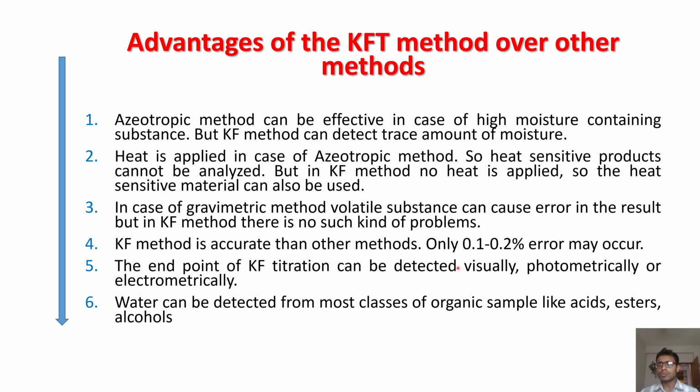Only 0.1 to 0.2% error may occur. The endpoint of KFT can be detected visually, photometrically, or electrometrically. Water can be detected in most classes of organic samples.